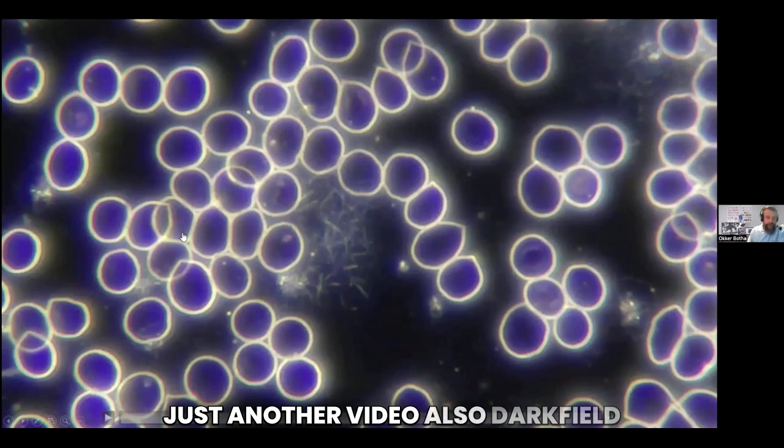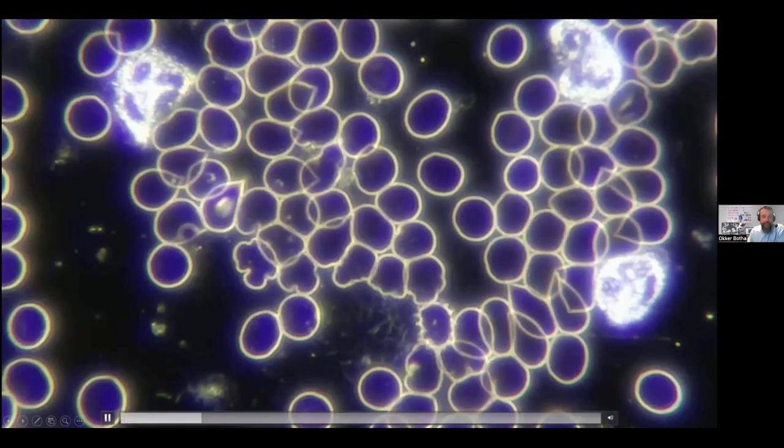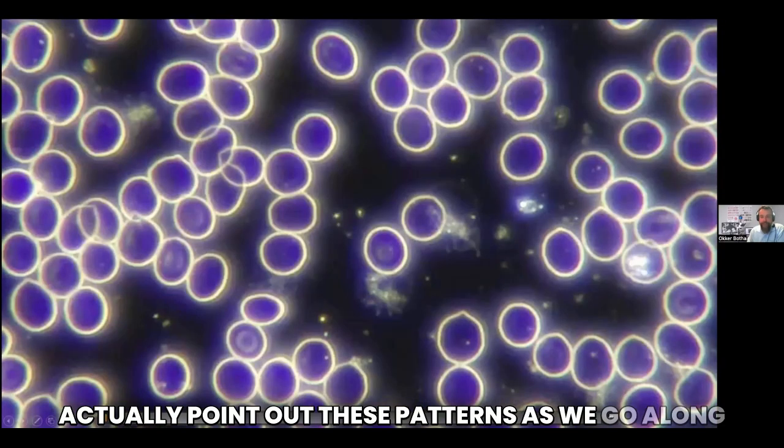Right, so just another video, also dark field. So we do see more interesting things in dark field. So a lot of the time we spend in the analysis is actually spent in dark field. Let me pause it as well so I can actually point out these patterns as we go along.